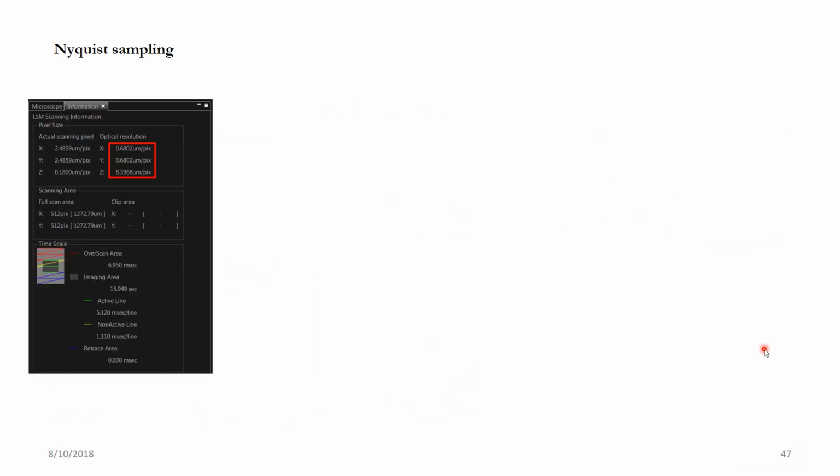So in our microscope, luckily we have a system where you can click optimize and the right optical resolution and pixel settings can be done. But of course you should be vigilant on doing it yourself so that you are sure that whatever you are doing is the right thing. Here is an example of what happens if you do the wrong thing.